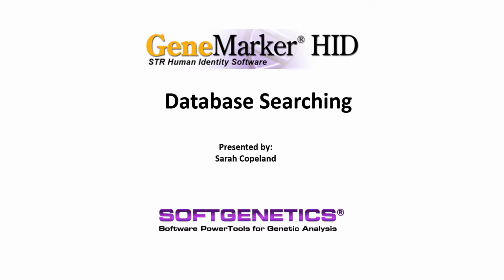My name is Sarah Copeland, and today I'll be talking about integrated database searching for unidentified remains in GeneMarkerHID. This is an advanced topic in GeneMarkerHID, so if you haven't already watched the introductory webinar, we encourage you to do so before continuing with this webinar.